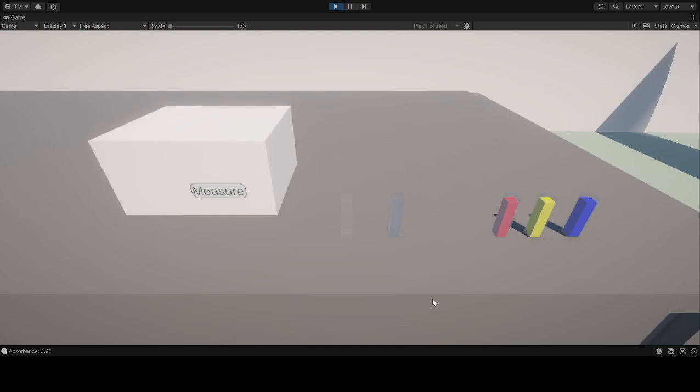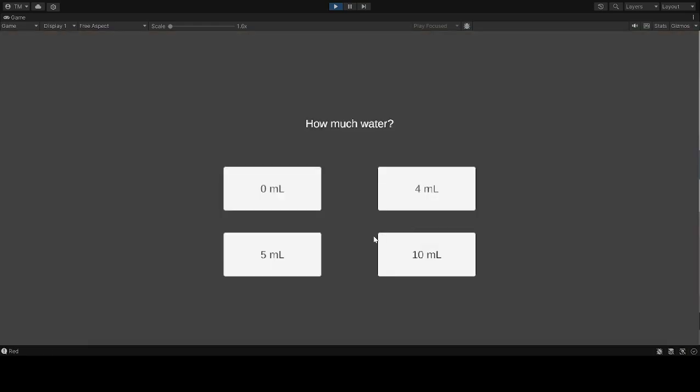So in part 3, students have to make concentrations, and they can do this by dragging over the stock solution to the water. And then they'll get a screen that asks them how much water they want to add. And they would do all 4 of these in order to get the data points needed to plot.